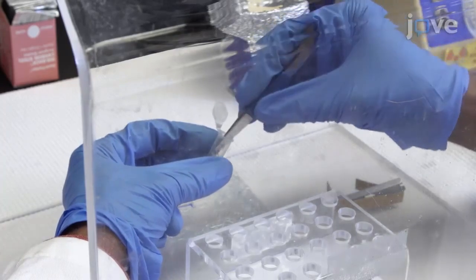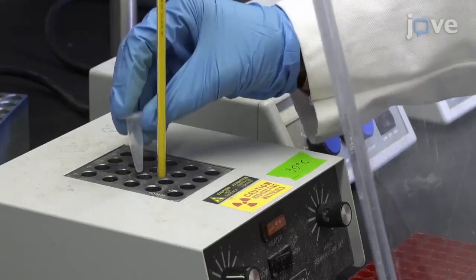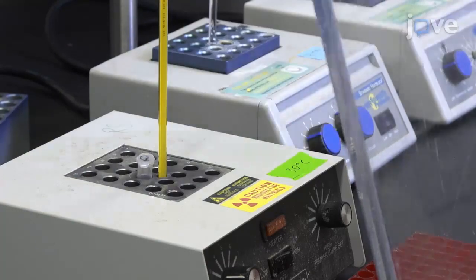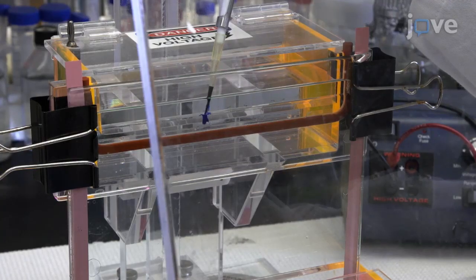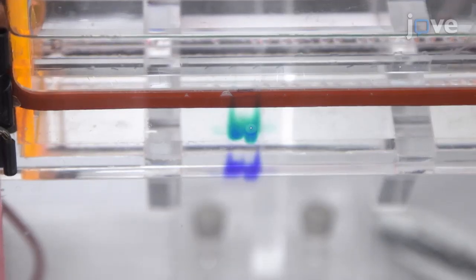This method can be broadly applied to any protein or reaction where desired molecules can be separated from undesired molecules. Make sure that the library is properly randomized, and make sure that during each binding and separation step, fold enrichment of desired molecules is high.